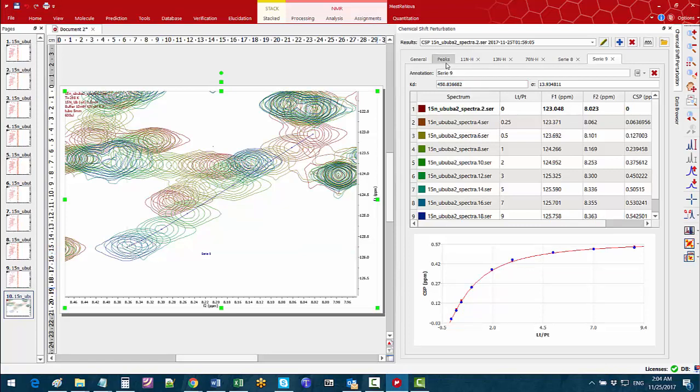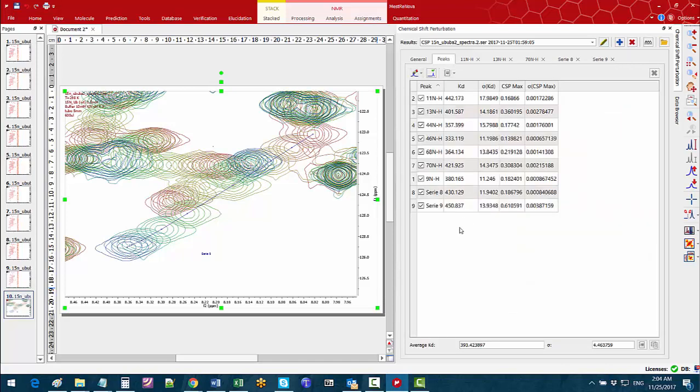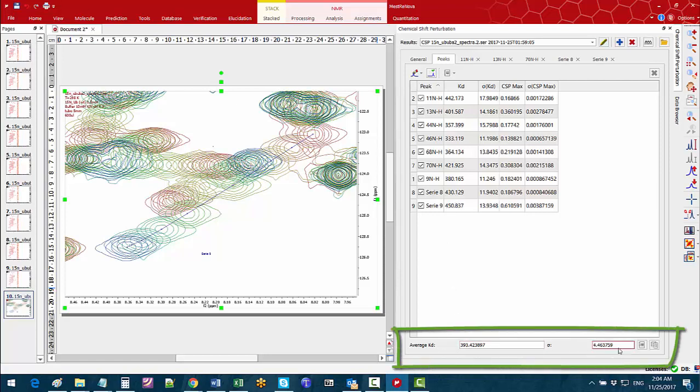From the peaks tab we can see all the peaks that are currently used to compute an average KD and error. Those values can be seen at the bottom of the panel.